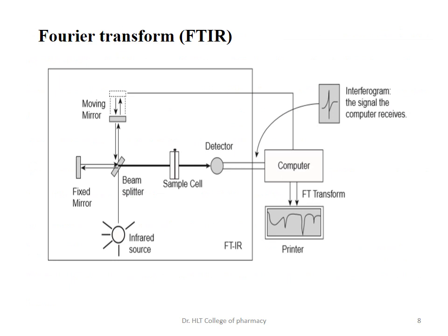This is an advanced spectrophotometer called the Fourier transform IR spectrophotometer, that is FTIR. The interferogram signal is received by the computer. Here a moving mirror is kept, which is called an interferometer.